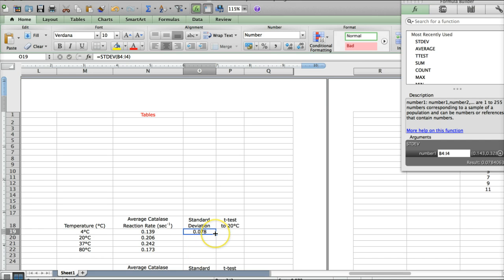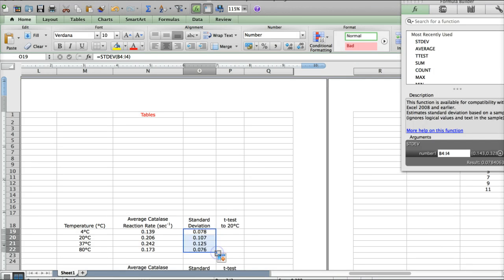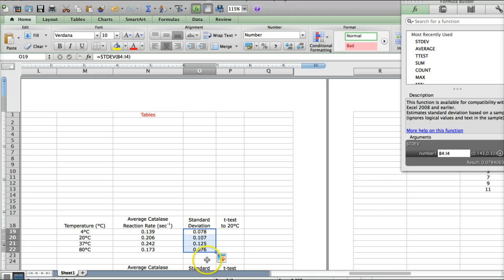The next thing you'll do is either continue doing the same thing for all of the temperatures or, like we did before, go to the bottom right corner where you'll get that black plus sign. Click, hold, drag down. And there you go. That's the standard deviation values for all of your temperature levels.